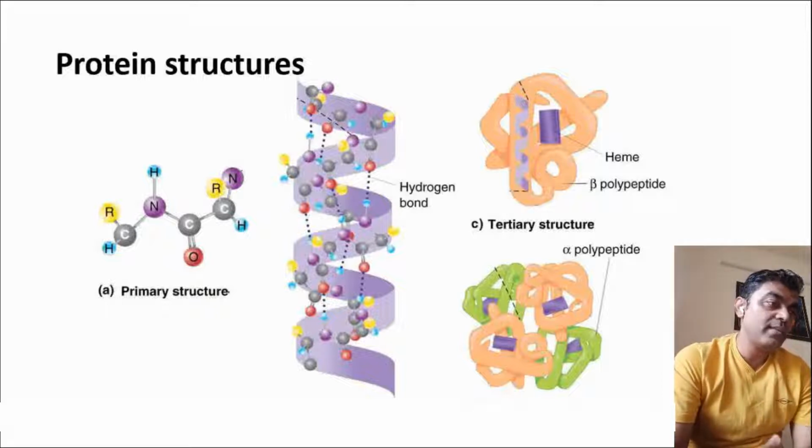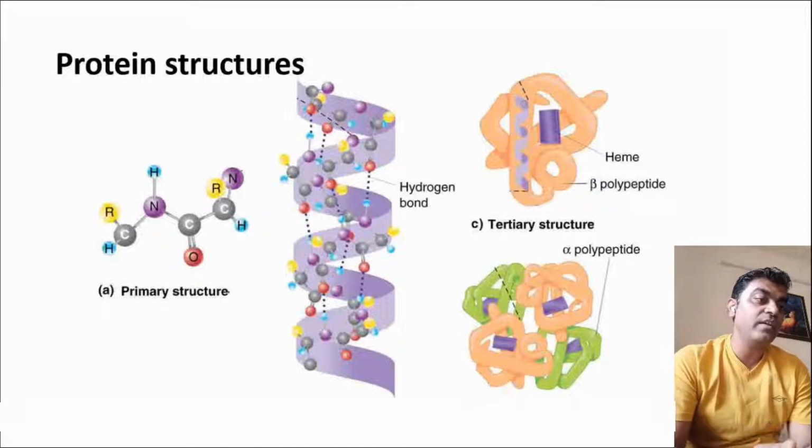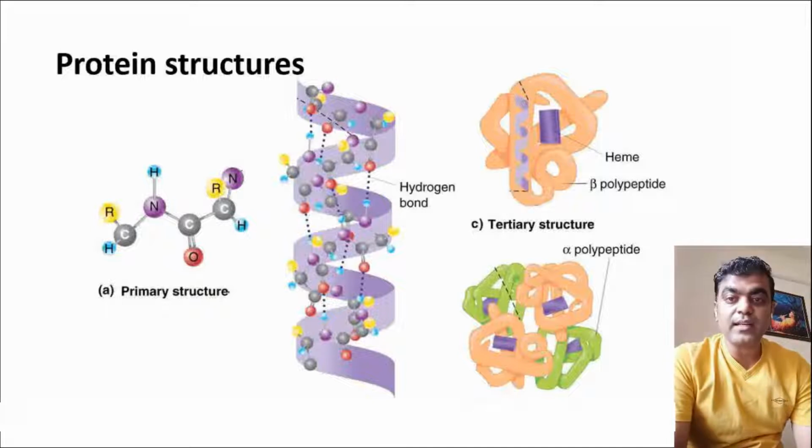And why getting a crystal is important: once it is a crystal, the structural orientation of the internal atoms becomes very finite and definite in shape, and then we can narrow it down to unit cells, where we can understand how these unit cells diffract the X-rays coming onto them.